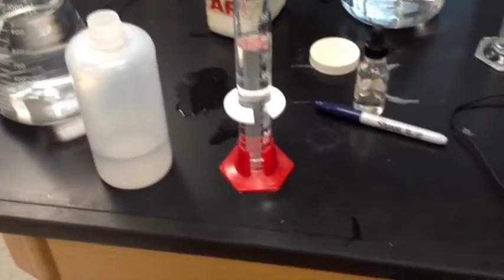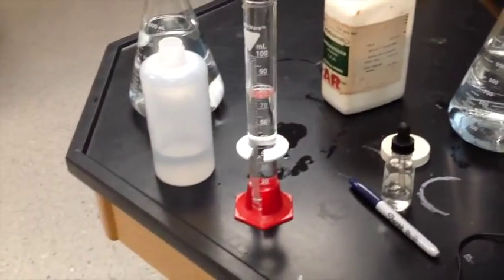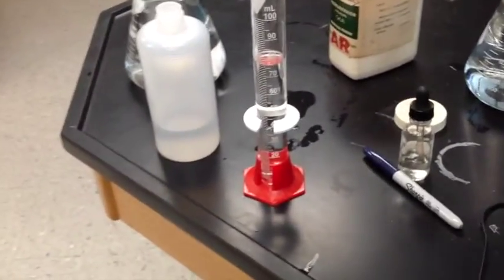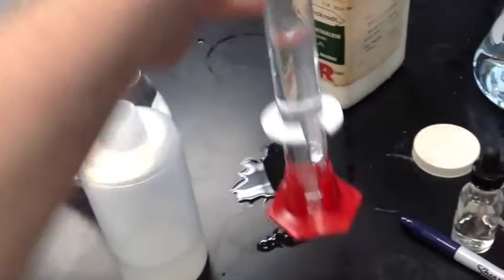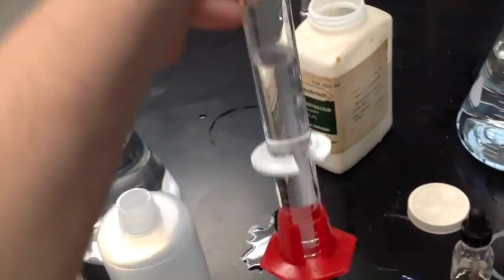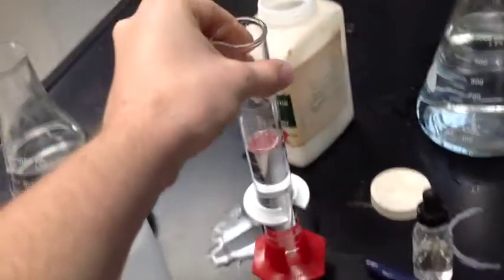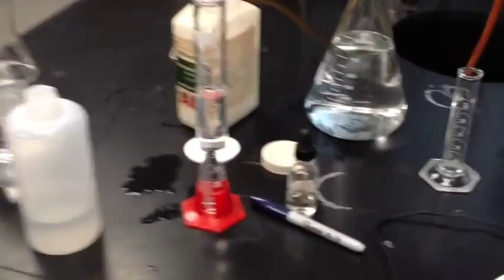So now I've got a problem in a lab. I can't just stick a pH probe in there and work backwards and figure out the concentration of the acid, because pH probes aren't that accurate. I need a really precise way to know what I just did. I just diluted that. I don't know how much acid I had in there, and I added water to it. Now I need to know what the concentration of this acid is. What's the hydrogen ion concentration?